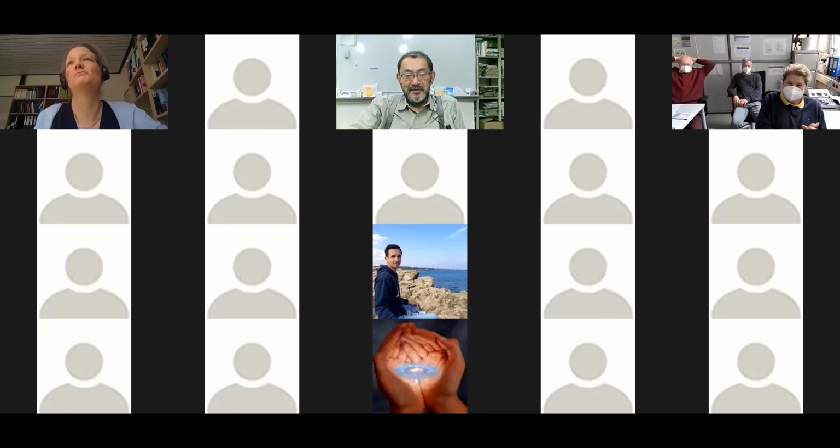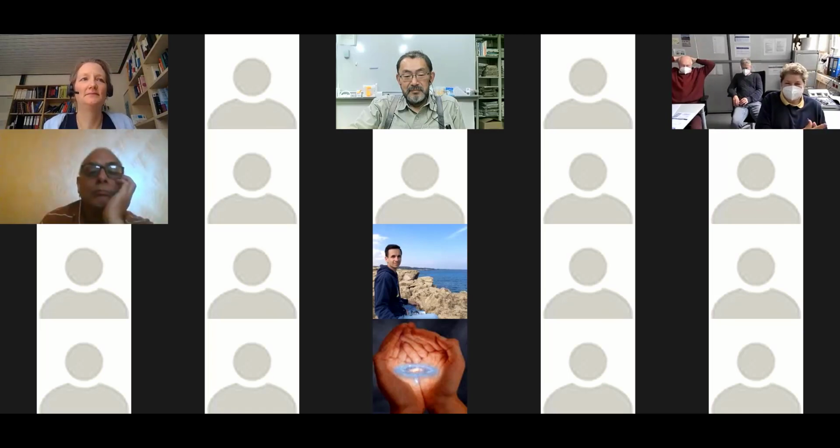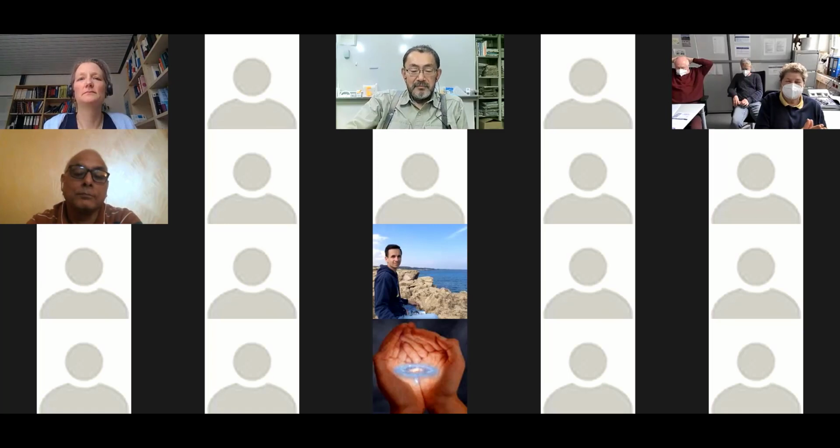So Jun, it was quite a fascinating talk. I think you pointed out a lot of problems which have to be considered. I have a problem because maybe I did not get the point. The topic of your talk was about the precision in TXRF. And you were talking about the problem of WD and the problem of ED and so on, and rough surfaces and things like that. But I lost the connection to TXRF. Can you comment on that?